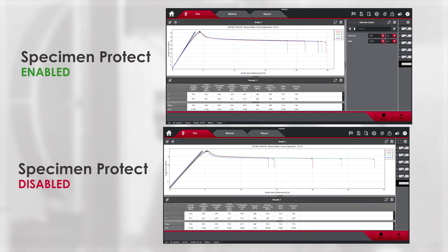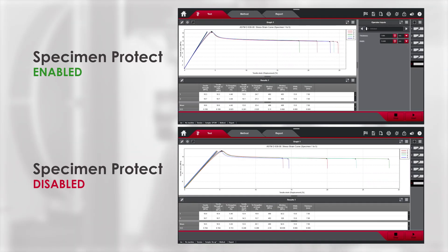Now that we've run 10 specimens, let's take a look at our results graph to see the effect Specimen Protect has had on our data. Both maximum load and maximum displacement had lower variability and higher averages for the specimens tested when Specimen Protect was enabled. Looking more closely at the graph, you can see the distribution of the curves at the region of failure, which really highlights the difference in variability.